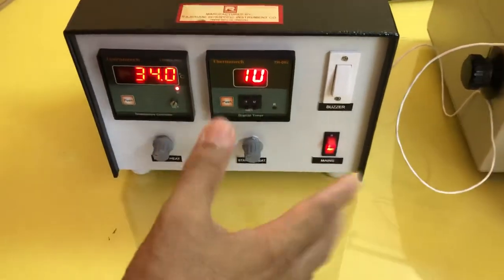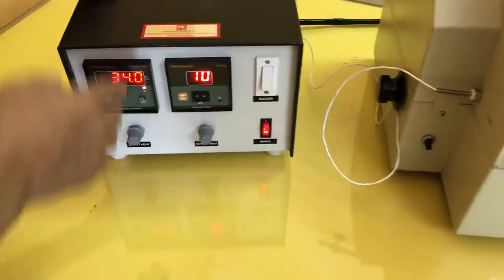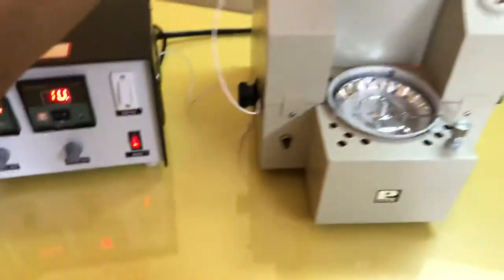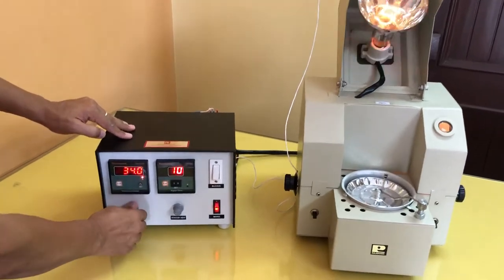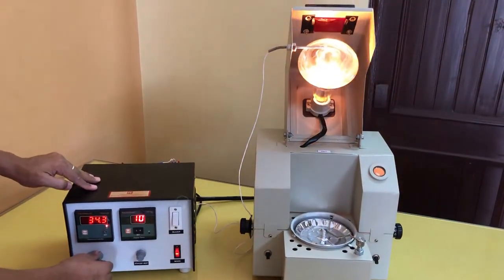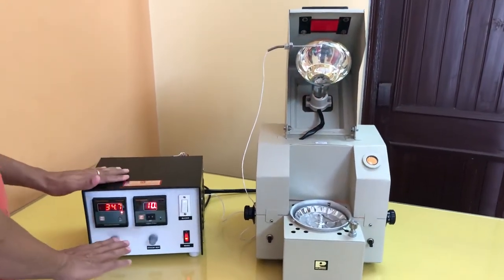It will keep the main bulb on till 110 degrees temperature is reached. This indicator light shows that power is given to the bulb. But as you can see, the bulb is not glowing. The main reason is this is a direct heat knob — if you increase it, now the bulb will glow. You can also vary the intensity of the bulb. Right now I have just kept it off.